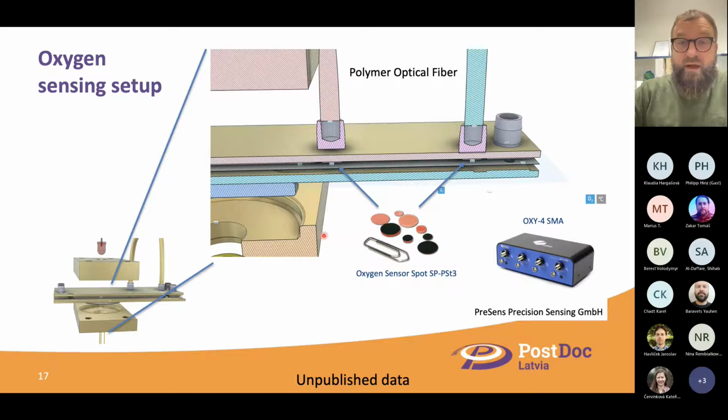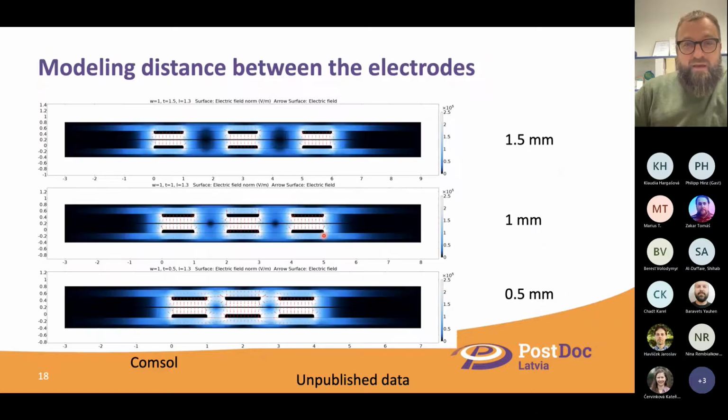So I decided to develop an oxygen sensing setup based on commercially available oxygen sensor spots. We are still developing, but I hope that this week there will be some results.